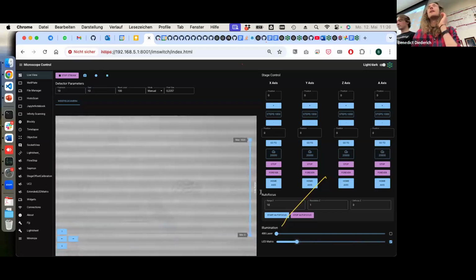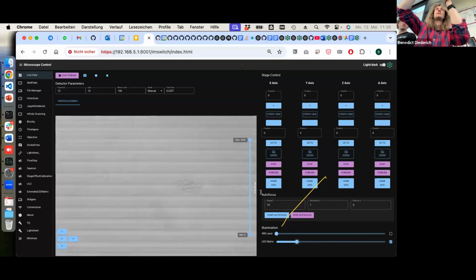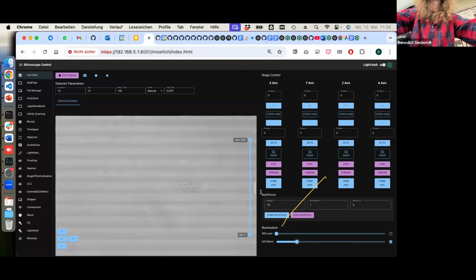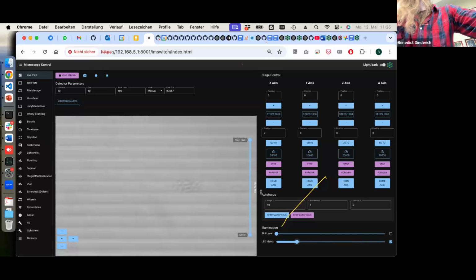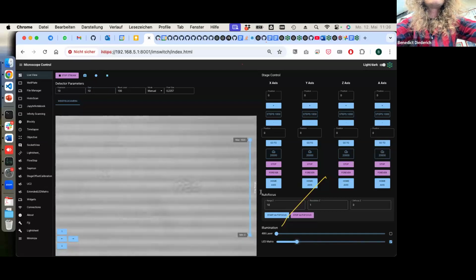That's good. Okay, now we insert the sample, this 3D print sample on glass. So it's this little structure. Let's see whether we can see anything. Is there anything on the screen? Not yet.